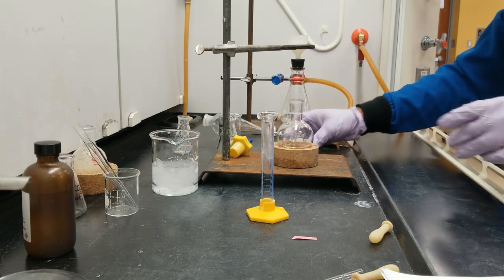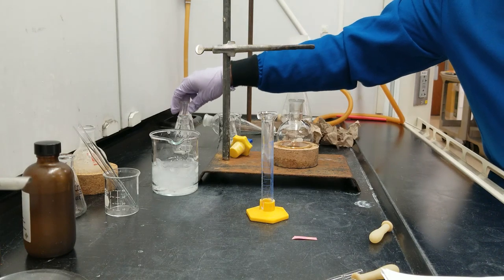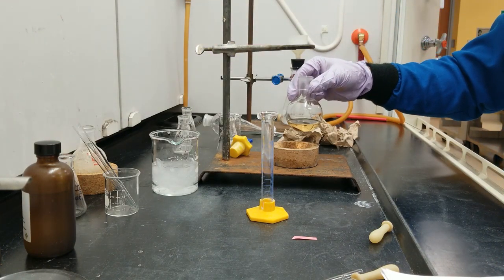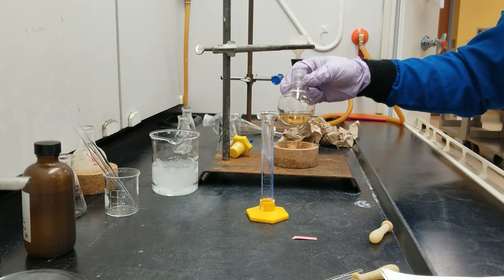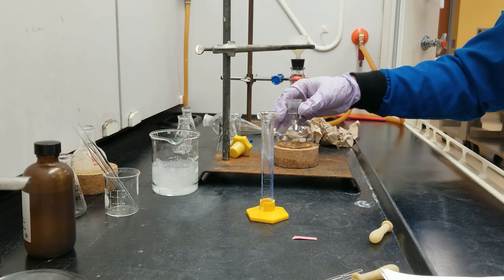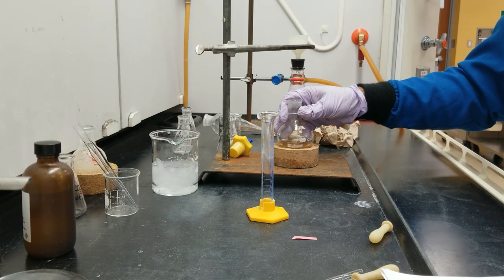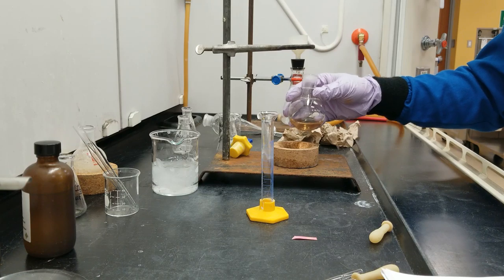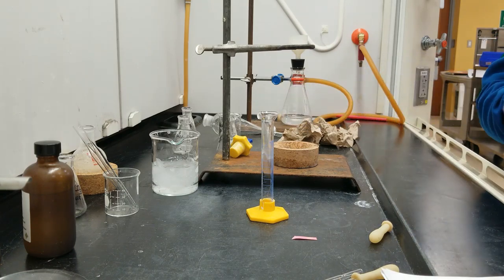Okay, so now we'll be working with the diethyl ether extract, or solution, of 2-naphthol. We'll evaporate the ether off, and we have our solid 2-naphthol in the round bottom flask.